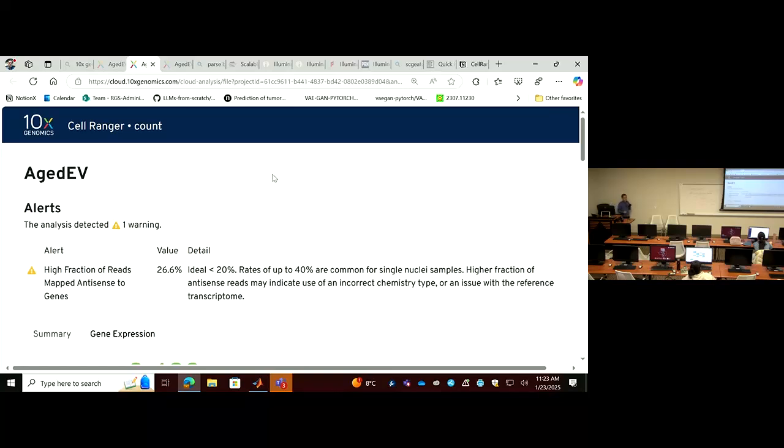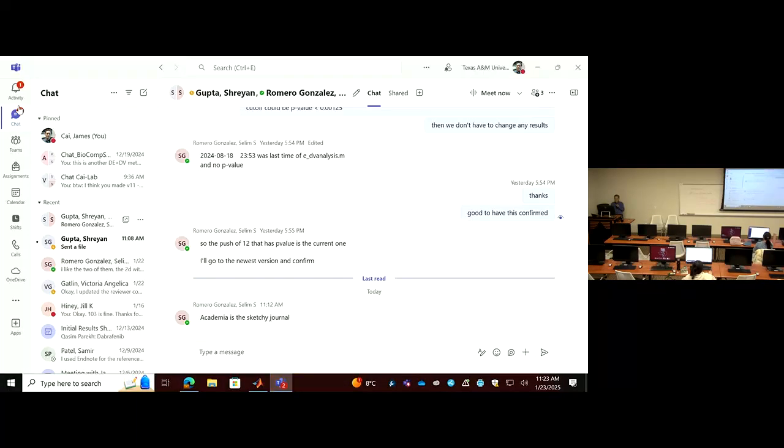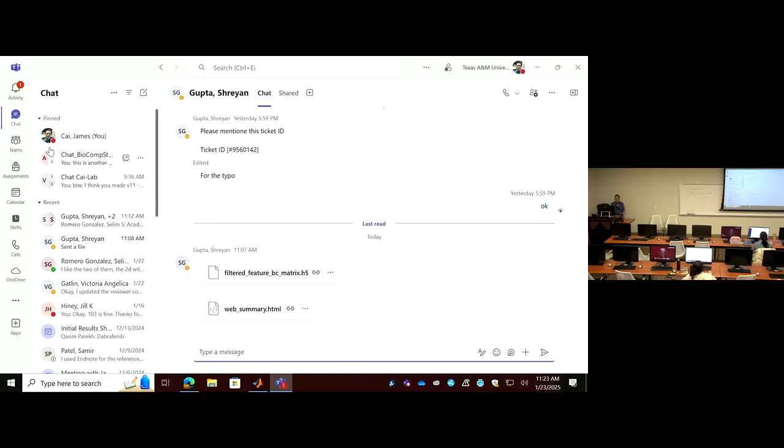Okay, have you finished your mapping job? How many have finished? Not yet. Still. Probably have to download the file. Sharon just sent it to us. Let's see.